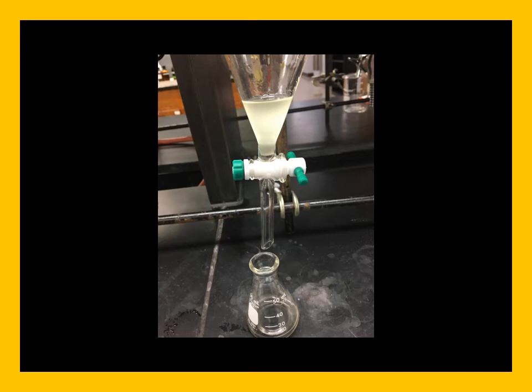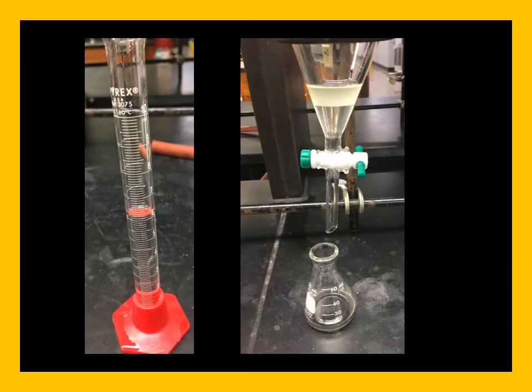I've now drained the dichloromethane layer off, and I am adding another 5 mils of dichloromethane, and once again shaking this up to make sure that I've extracted all of my product into the lower organic layer.